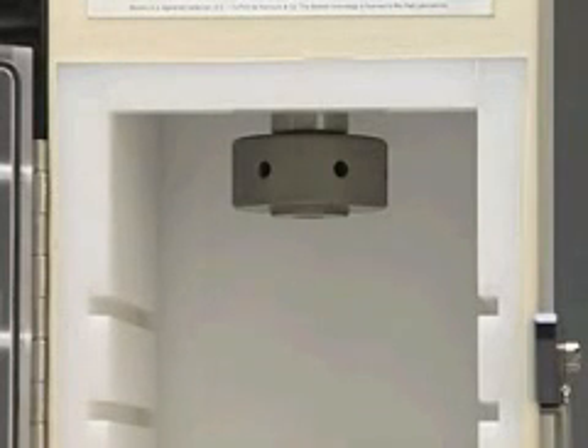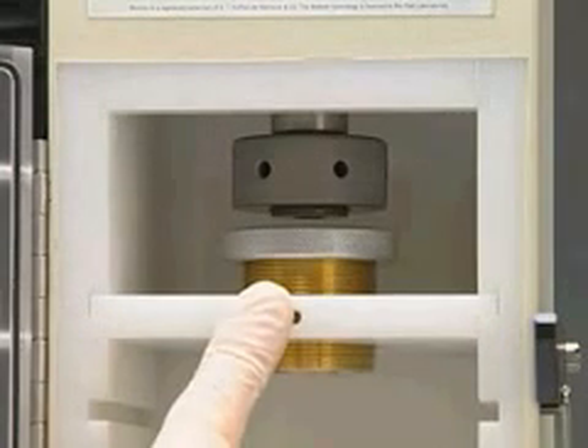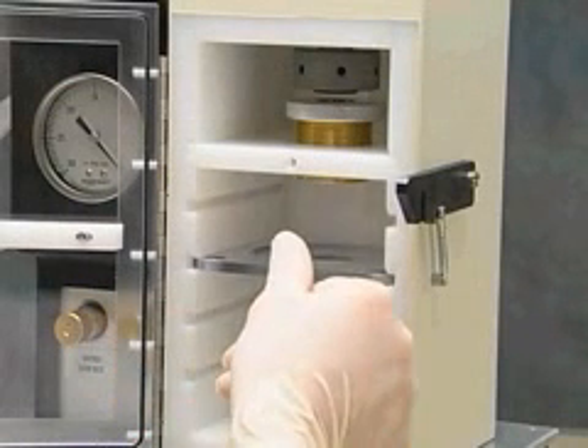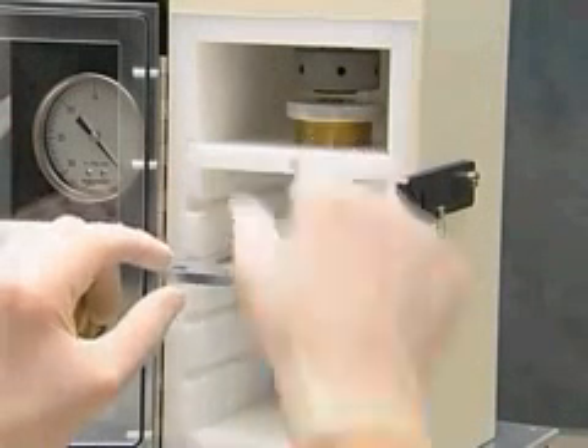Place the microcarrier launch assembly in the top slot inside the bombardment chamber. Place the target shelf at the desired level inside the bombardment chamber. Place the sample on the target shelf.